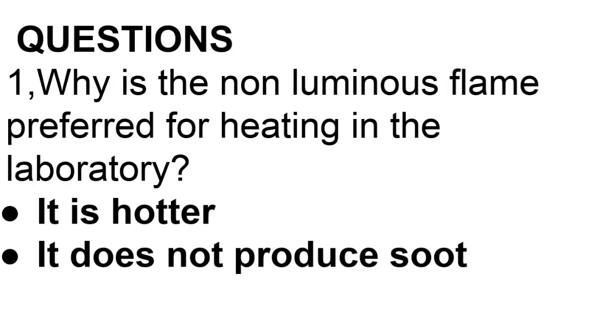Now, some of the questions which can be or have been asked from this particular subtopic include: number 1, why is the non-luminous flame preferred for heating in the laboratory? That is what we discussed in the first experiment, whereby we realized that it is hotter and it does not produce soot. Therefore, it does not dirty the apparatus.